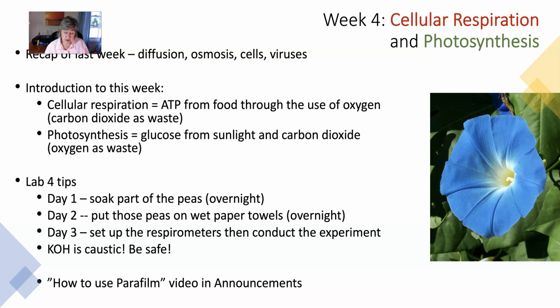I will also post a video that I've made on how to use parafilm because it tells you to use parafilm in the instructions, but of course you don't know how to use parafilm. You've never even seen it before. Parafilm is a stretchy wax paper, which is interesting. I wish they sold it for household use because it is so cool. It stretches over surfaces. You're going to stretch it around the end of the pipette, but also the end of a tube and all sorts of things. There are all sorts of uses for parafilm, and I will put that video in the announcements also so that you have that as a reference point.